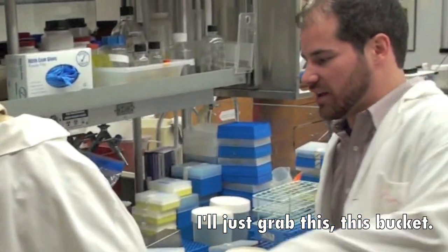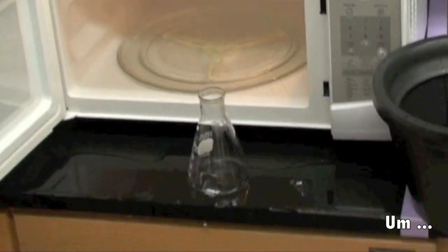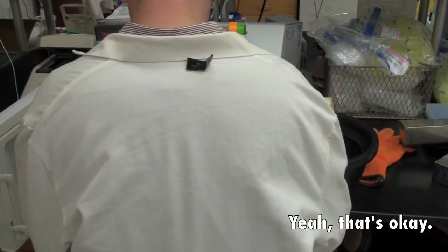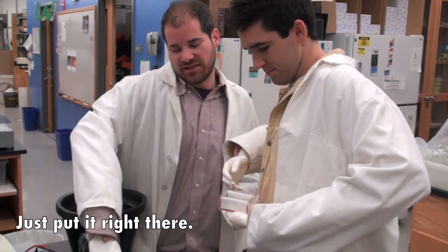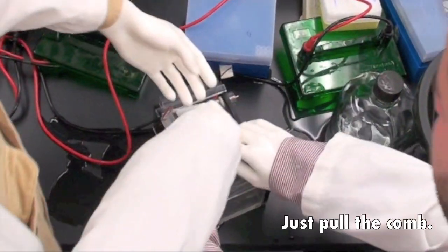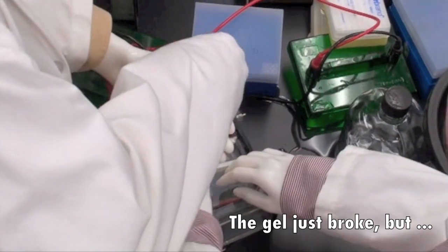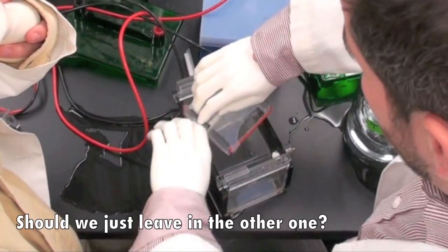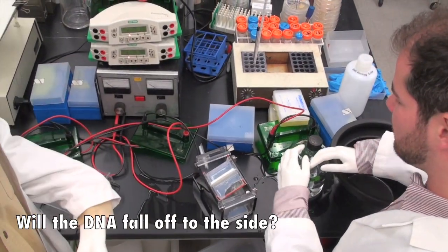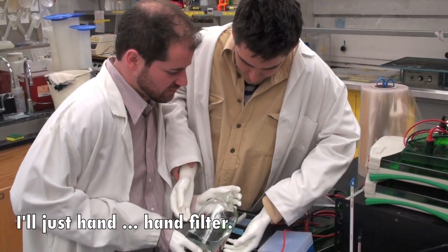Let's grab this bucket. That's good. It's perfect. I just broke it. Yeah, it's okay. It's just broken glass and hot water. Take the gel. Just put it right there. Just let it go. That's perfect. Just pull the comb. Alright, you know, the gel just broke, but perfect. That's great. That's it? Should we just leave in the other one? Yep. All right, will the DNA fall off to the side? No, just pour it through my fingers. I'll just hand filter right there. How much? That's good. Perfect.